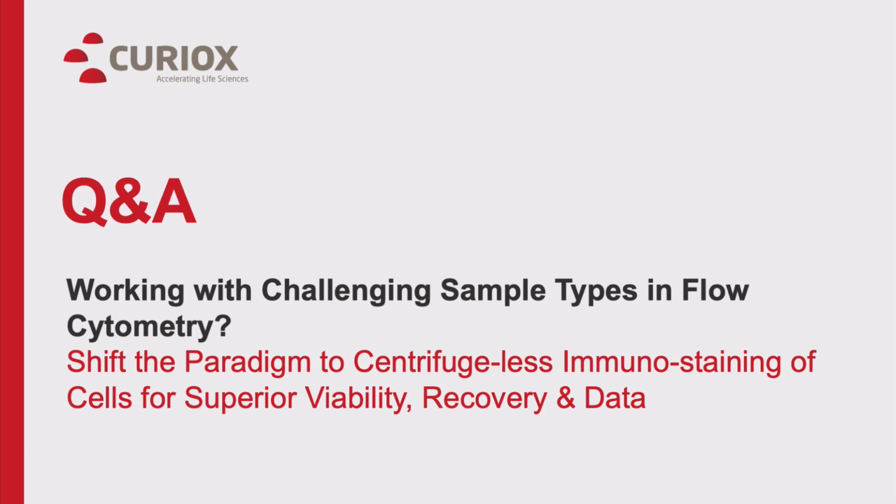Again, it's going to depend on the sample type and the cell number. And you can range anywhere in the system from 10 million cells. Again, in PBMCs, it can handle from 10 million cells down to about 1 cell per well. So you'll just have to fine-tune the settling time based on the sample number and the type of sample, but 30 minutes is kind of a general ballpark.